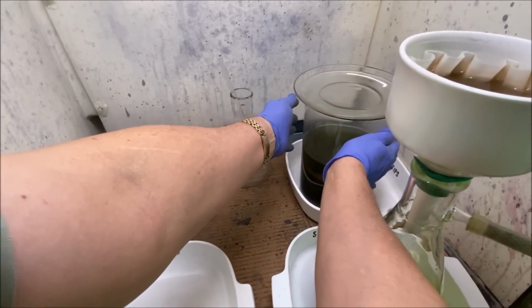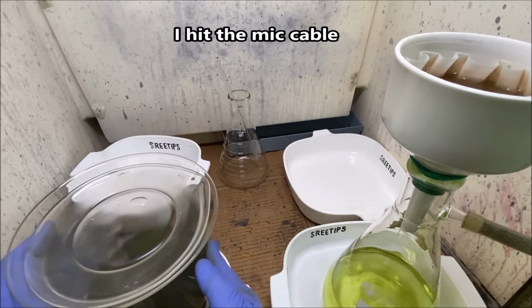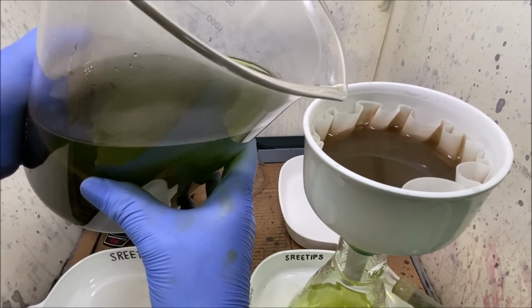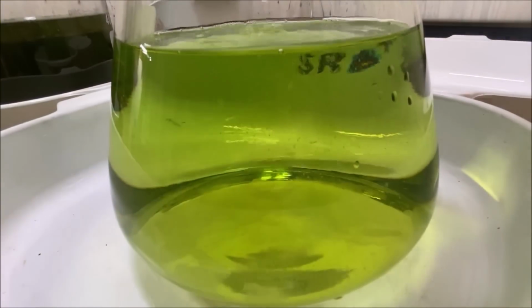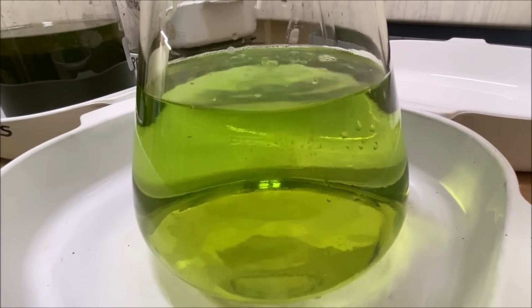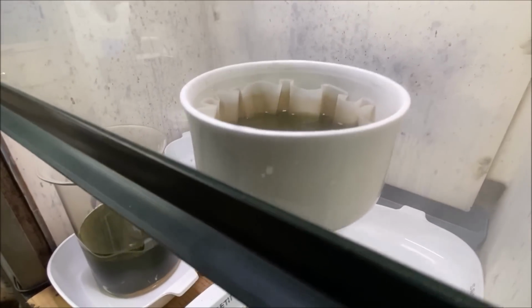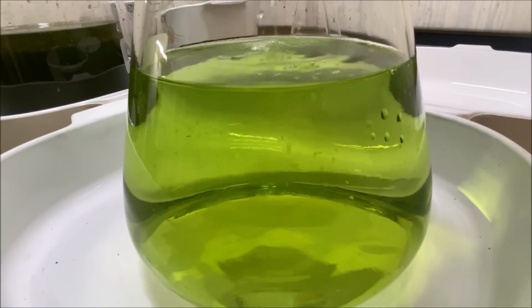Alright, next we're going to start filtering the gold out of this beaker. I just had to get a shot of this. The liquid inside the flask is at ambient temperature, and it's boiling. And what I did is I tuned up my vacuum system, replaced a couple of fittings, replaced some hoses, and it made a world of difference.